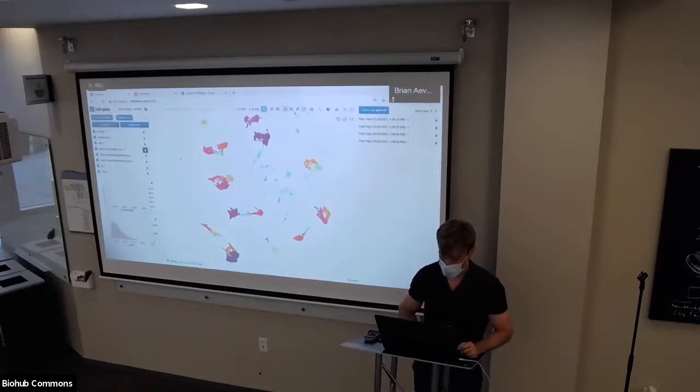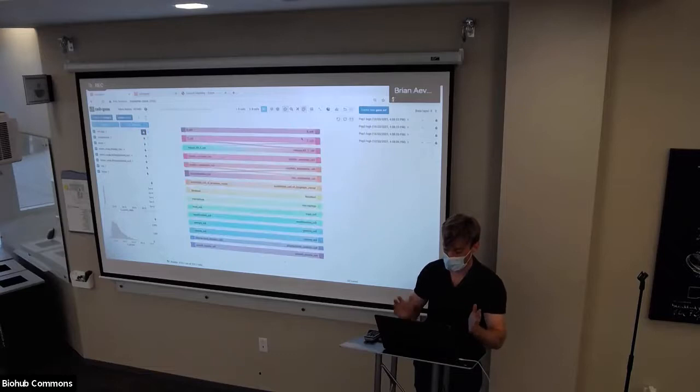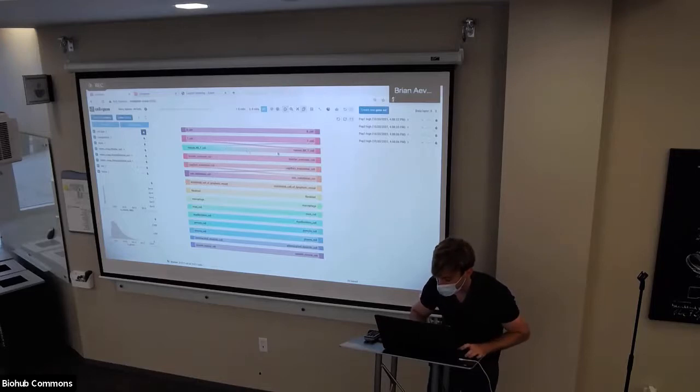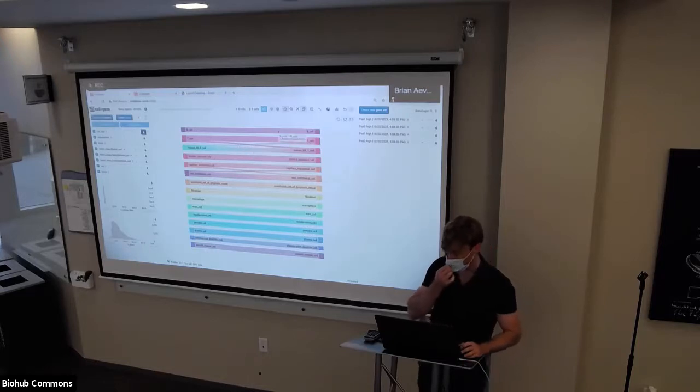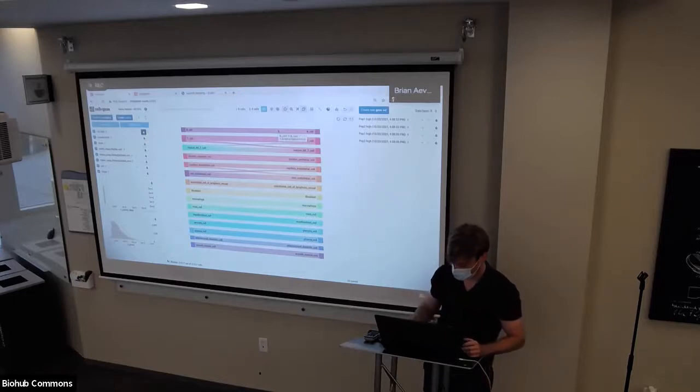Alternatively, if you just want to see how good are the cell type labels by themselves, with respect to the manifold, you can actually just only check one category and then hit sankey plot. And then it'll actually check how well does it align to itself in your low dimensional space. Here you see the T cells and mature NK T cells are a little bit mixed, which makes sense because there's like an edge crossing them. So this is a sankey plot, and it's going to be really useful for actually trying to continuously refine your annotations.